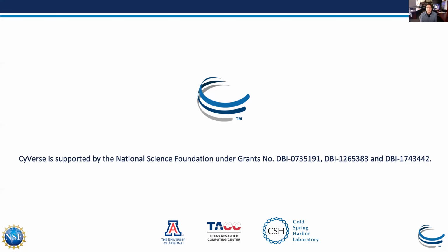Okay, a couple of questions have come in. Can Circos be used to compare bacterial genomes? Yes, in fact, there's a recipe. If you go right there for the first recipe, I forget which section, if it's 8 or 9 or 7, there are some recipes, and one of the examples they show is using it for a microbial genome. I would start there.